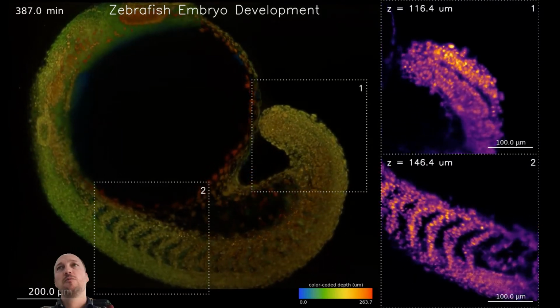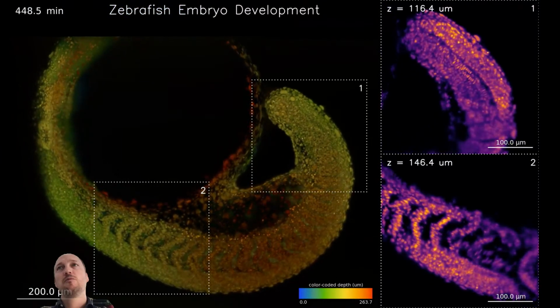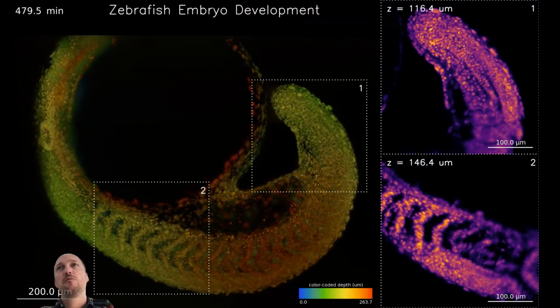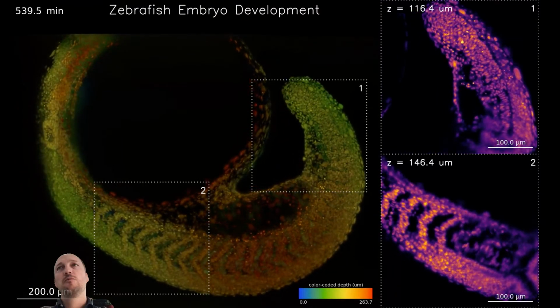And the video keeps going on. We have two slices on the right side, and a color max projection on the left side. So you see we can image fairly fast for a long period of time and get this very beautiful image. And this is done with stage scanning, right? But stage scanning with this LS3 trick.